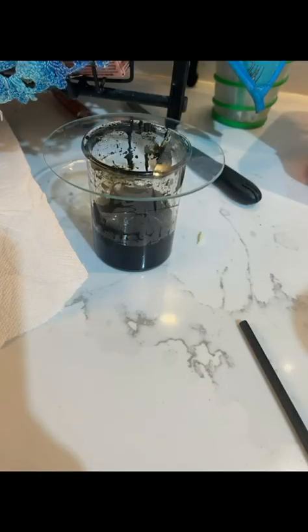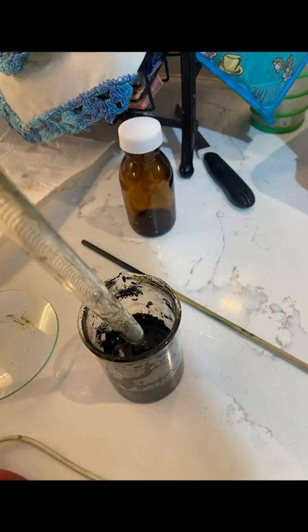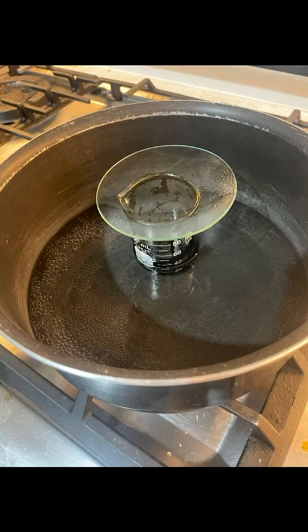Two phases formed: a light yellow upper phase, biodiesel, and a denser darker lower phase, glycerol. We drained the glycerol and dried the biodiesel in a water bath at less than 60 degrees Celsius until it was completely clear and free of turbidity. We transferred the biodiesel to a secure amber bottle.